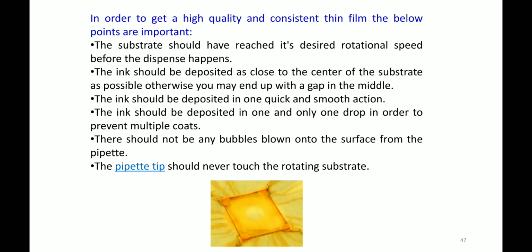The pipette tip should never touch the rotating substrate. You have to go close enough, but you cannot touch the tip to the surface of the substrate. Otherwise there will be some scratch, and that will not give you a high quality thin film.